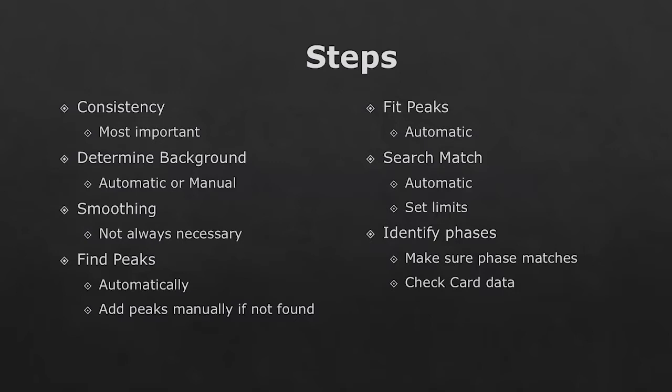Smoothing. Some people say that they don't like to smooth the data at all. I do it sometimes if I get noisy data. The one thing that I'll notice between smooth data and non-smooth data is that you typically get better peak fitting with the smooth data.